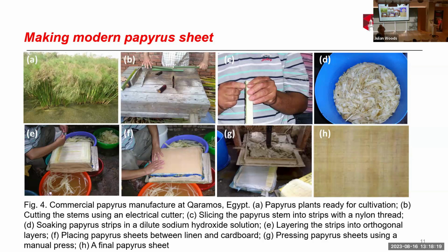The date of papyrus? This is something, but if you already have the date in the museum catalog, why do you need it? Authenticate, wow, I like it. Yes, what else? Really? We can use analysis for dating papyrus. We can compare an undated sample with one we already know the date of and see the similarity in the chemical composition. Authentication, yes. When we compare fake papyrus and an authentic one, we can see the difference.